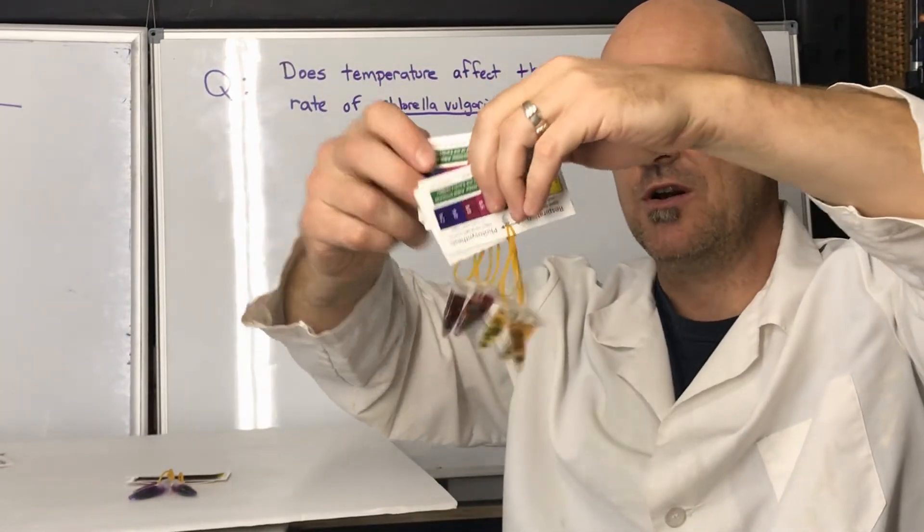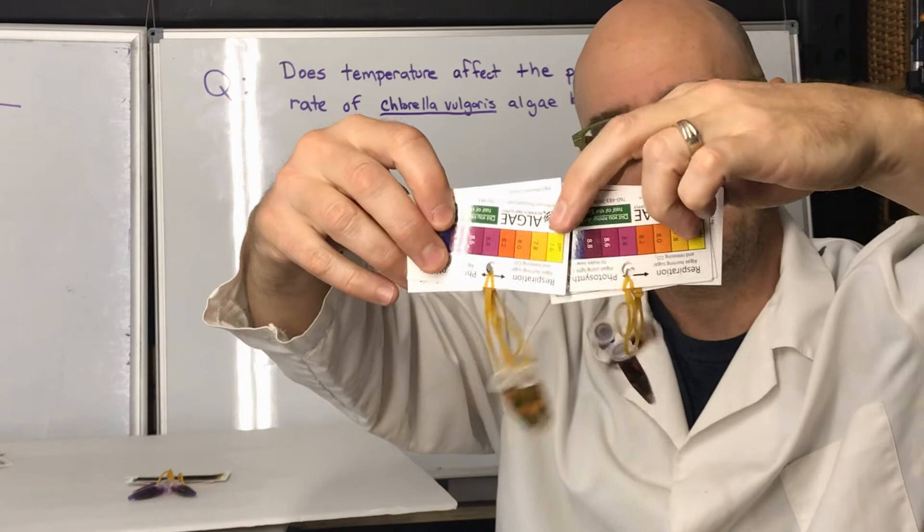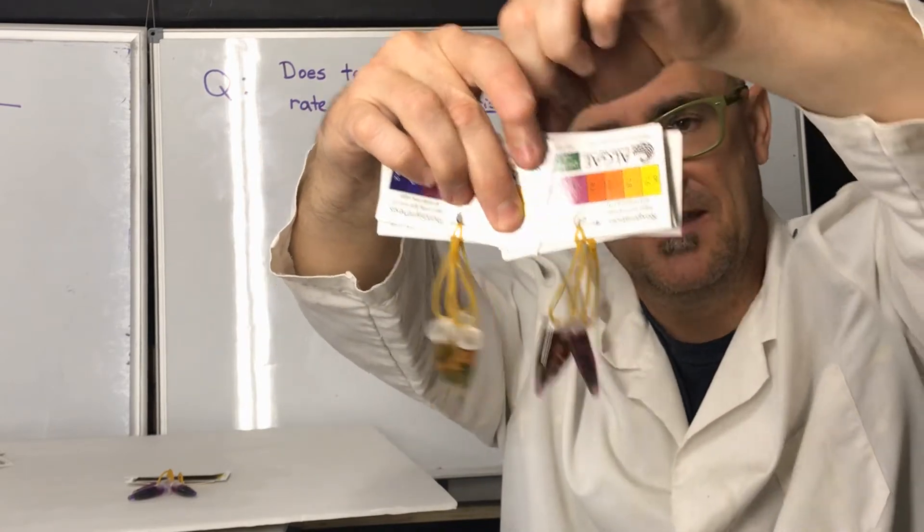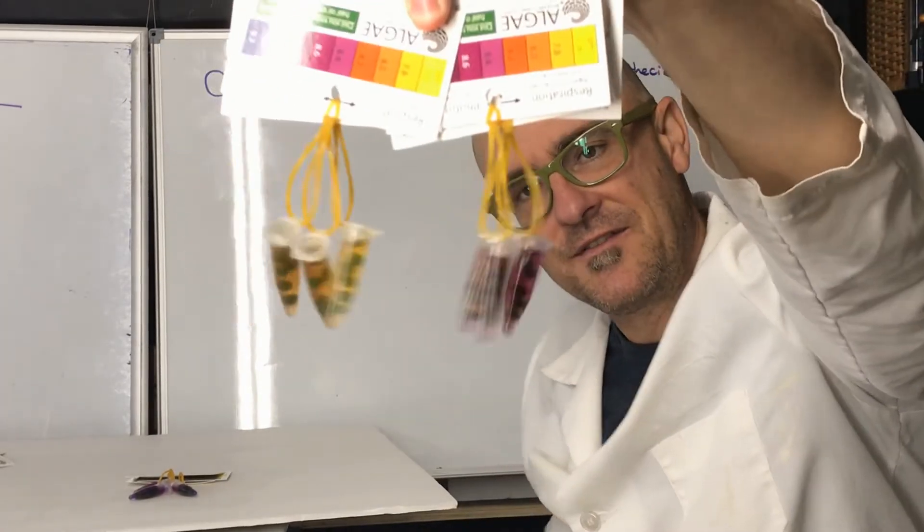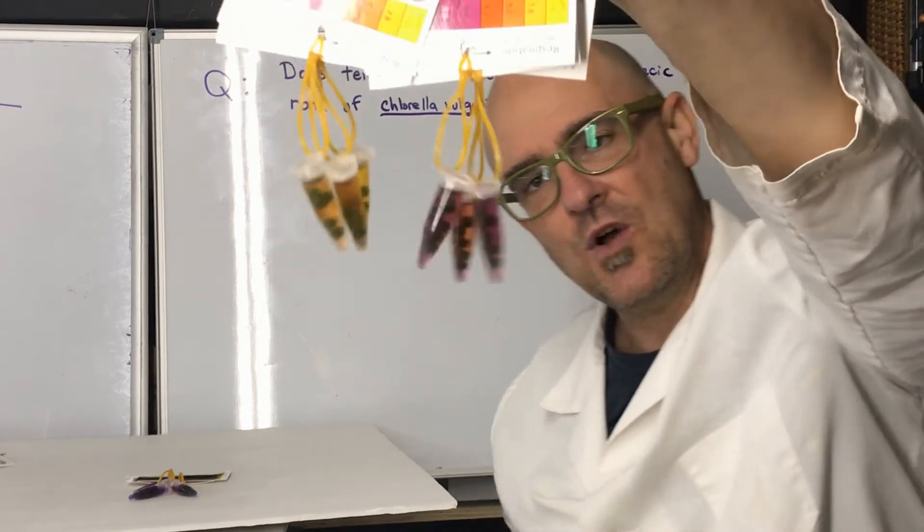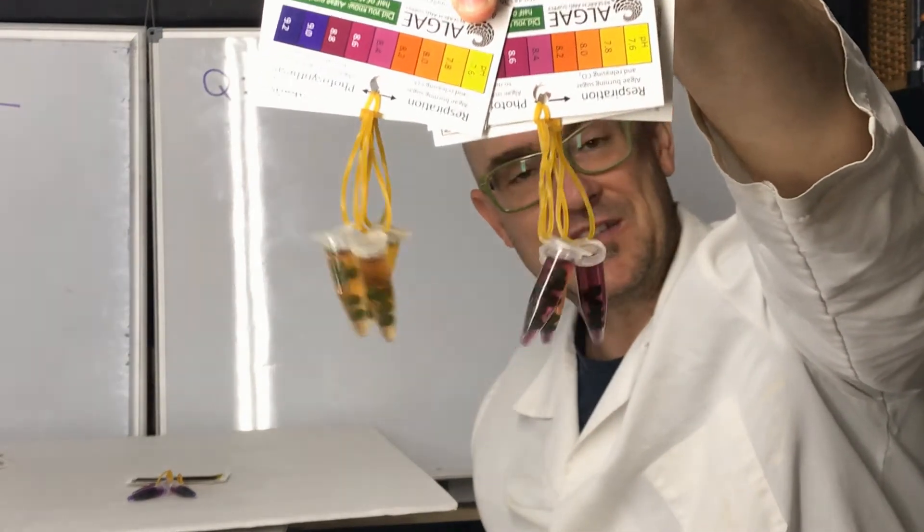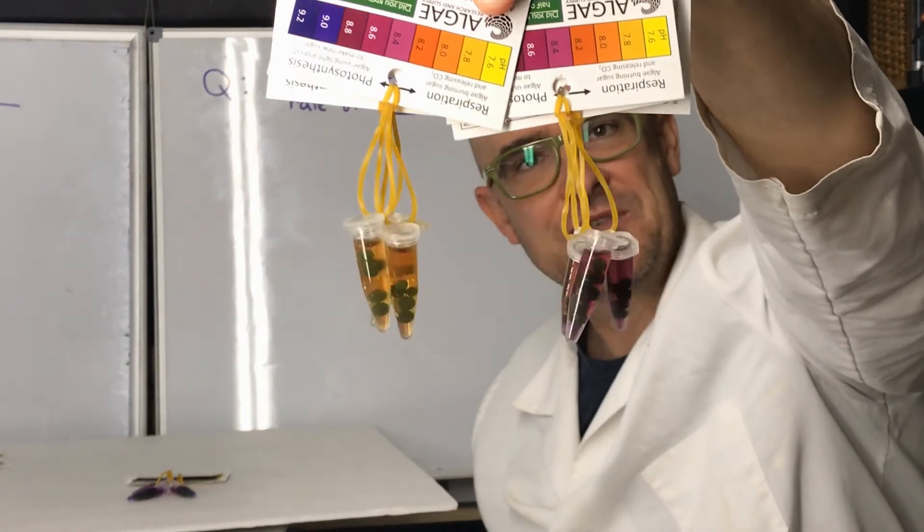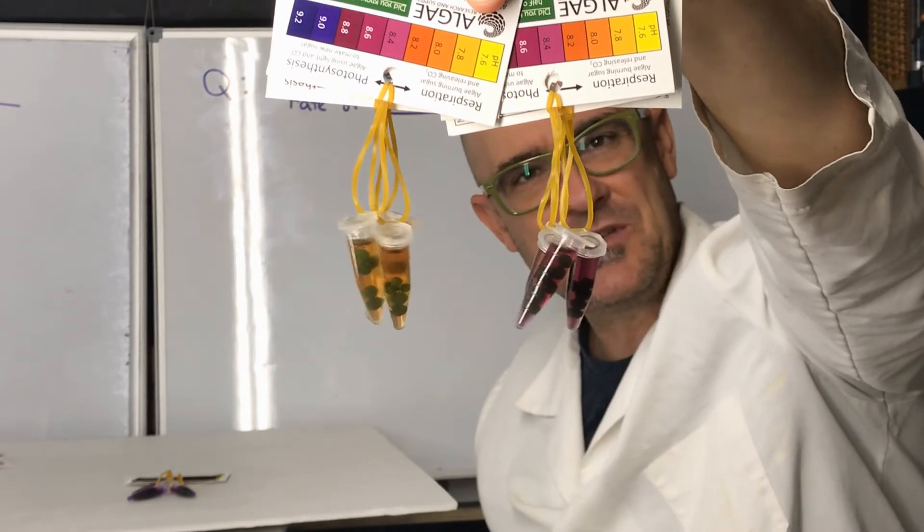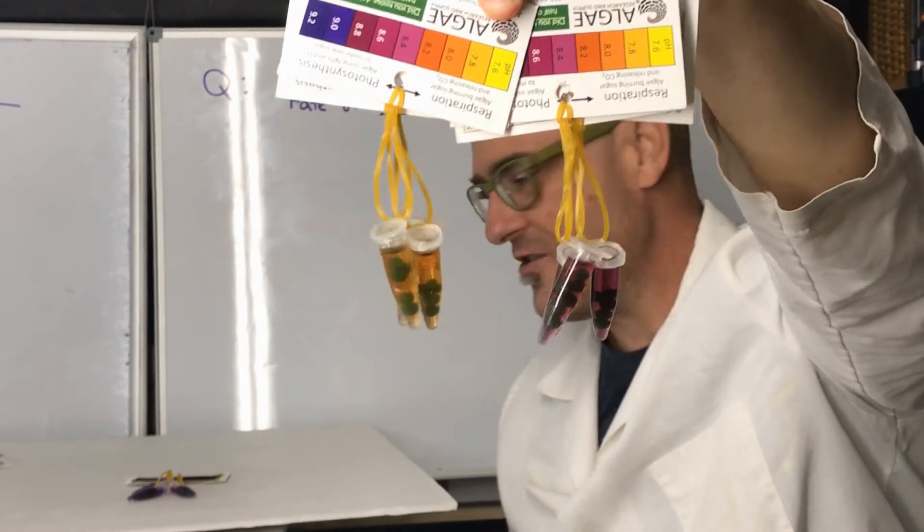For the room temperature, those ones, photosynthesis did occur. Well, photosynthesis occurred in the first one too, but this one the rate was a little bit higher. This one got the pH up to somewhere in the 8.2 to 8.4 range.